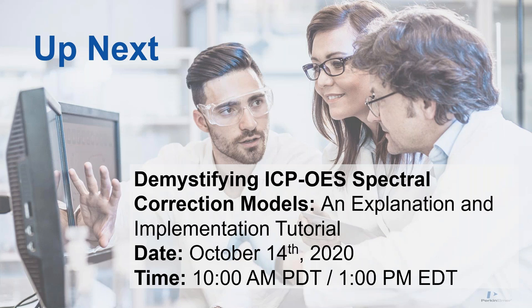Yeah, when there are organics being aspirated into the system, you look in the plasma, you can see the organics in the plasma is pretty obvious, so you can definitely look at it and make sure it's off the base there.